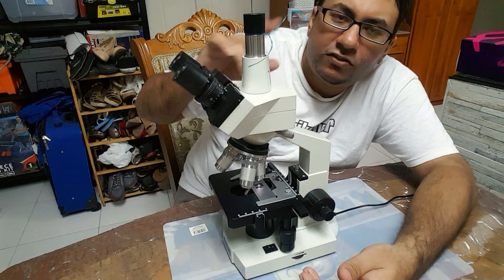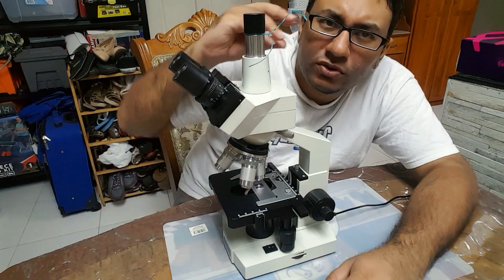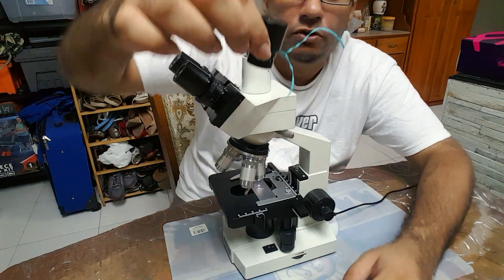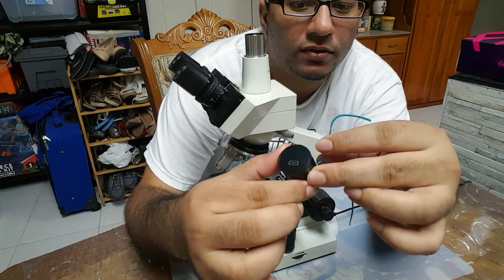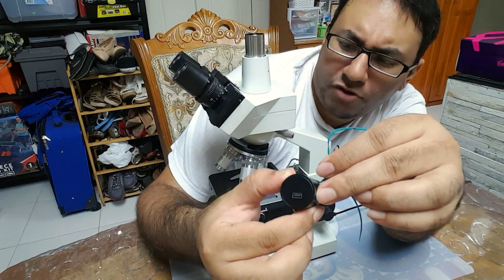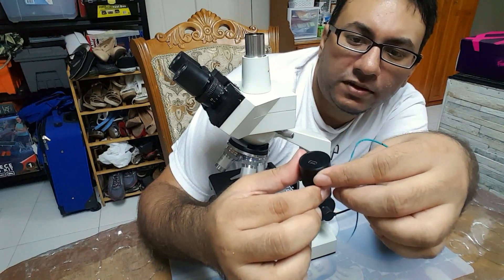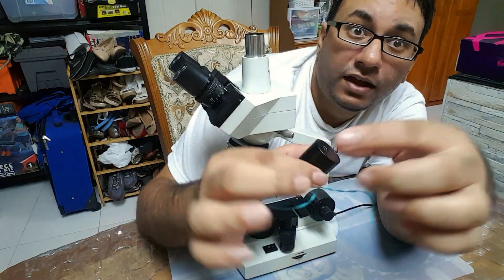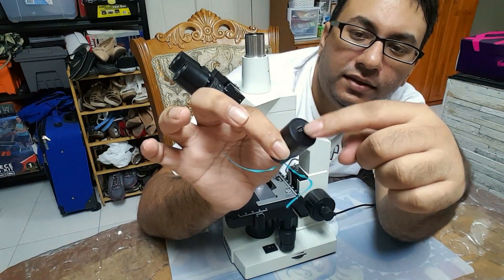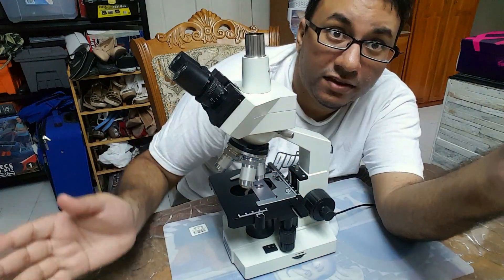The reason I really bought this is that it's a trinocular microscope — 'nocular' means eye, binocular means two eyes giving a 3D view, and trinocular adds this third piece, which is an actual camera port. This particular model I paid about $300 USD — it currently goes for $319. I bought it because it came with a 5-megapixel camera. It uses a mini USB cable, which was included, and you plug that in to view on a laptop.